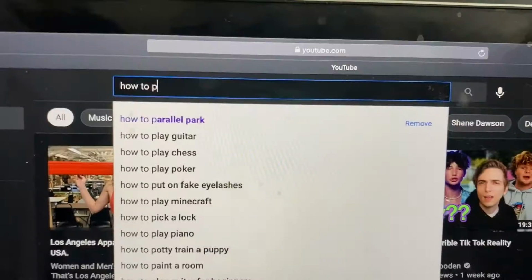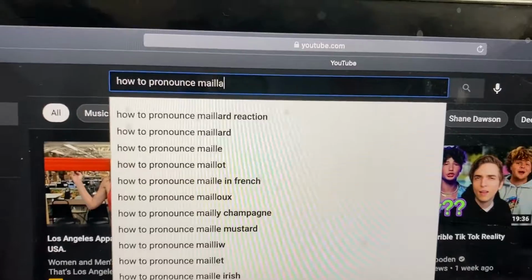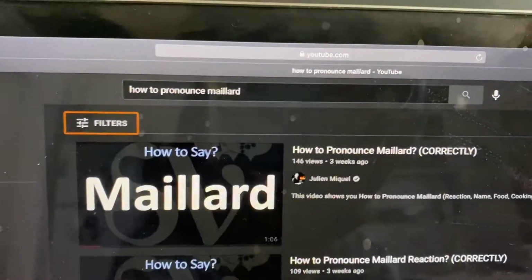Hi, my name is Michelle and I'm going to be walking you through Experiment 50B, the synthesis of caramel from milk and sugar. This reaction is called the Maillard reaction, a word of French origin. In French, it is said as Maillard.